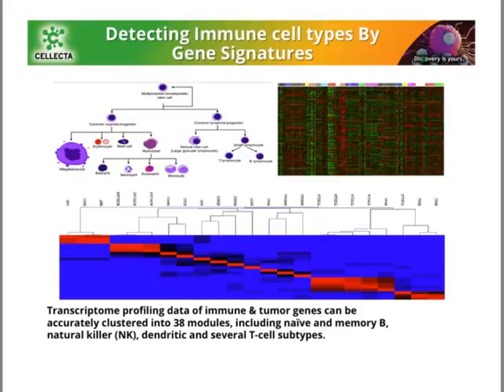On the right is the expression profile. And then what we have spent a lot of time building is classifier models and algorithms. So what we've tried to do is put this data into our proprietary algorithm and try to see if we can separate a T cell from a mixture of all other cells. Can we look at a specific macrophage compared to all other cells?